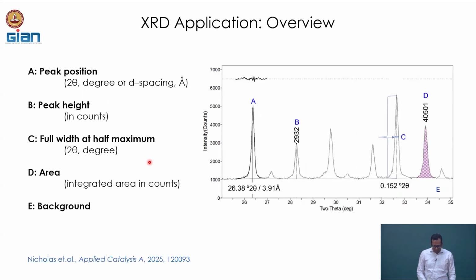Okay, so with that little bit of background on the XRD principles and X-ray sources, let's look at a few applications. Before we go into those applications, here is one typical X-ray diffractogram. That's how it looks.